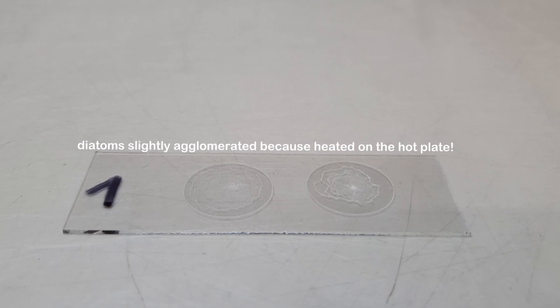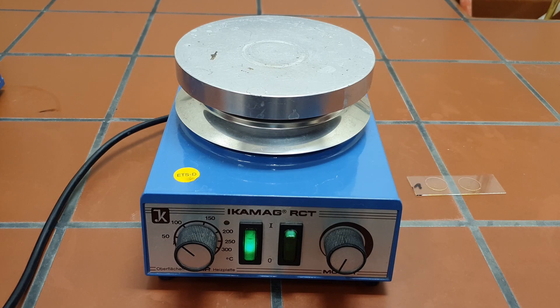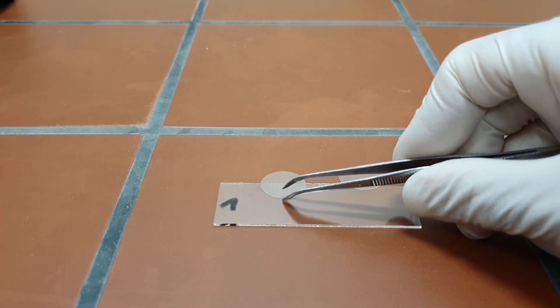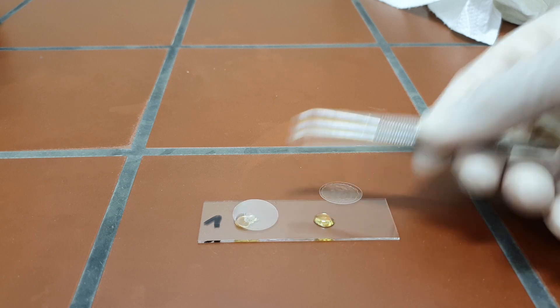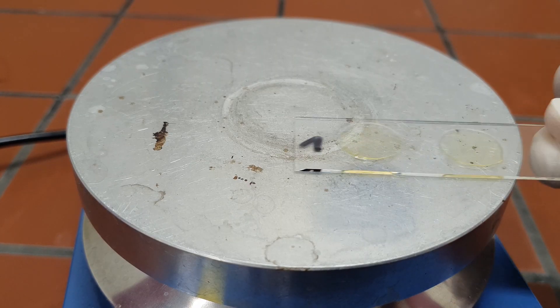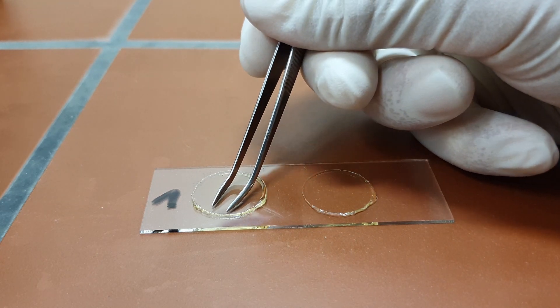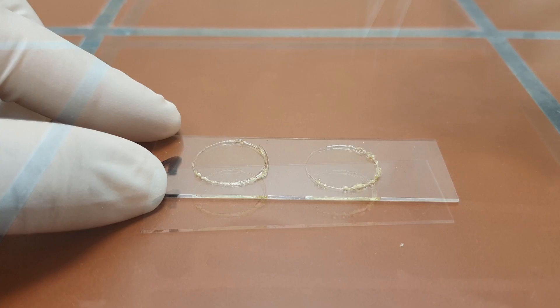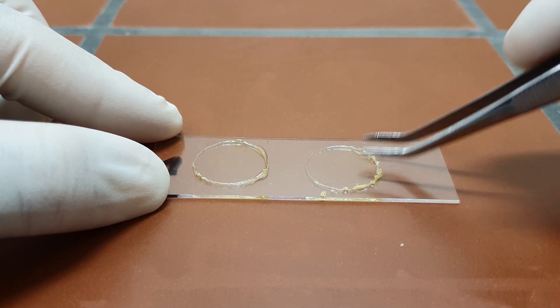Once the cover slips are dry, they are ready for mounting. This must be done in the fume hood. Preheat a hot plate in the fume hood to 110 degrees Celsius. Place one to two drops of Nafrax onto the microscopic slide using a glass rod, and invert the cover slips with the dried diatoms quickly onto the drops of Nafrax. The microscopic slide is then placed on the hot plate for around two minutes until the solvent is evaporated. When no more bubbles are forming, move the slide from the hot plate onto the workbench and quickly but gently press down both of the cover slips. The layer of Nafrax should be without air bubbles and as thin as possible. Excessive drops of Nafrax can be removed afterwards with a scalpel.